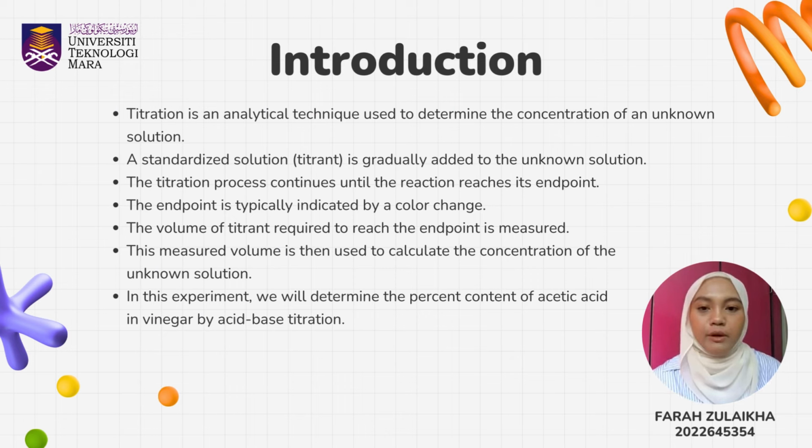Today I will be talking about the introduction of titration. Titration is an analytical technique used to determine the concentration of an unknown solution by gradually adding a standardized solution, the titrant, until the reaction reaches its endpoint, which is indicated by a color change. The volume of titrant required to reach the endpoint is then used to calculate the concentration of the unknown solution.